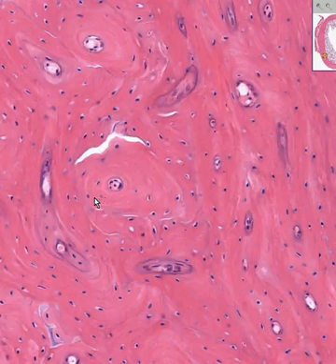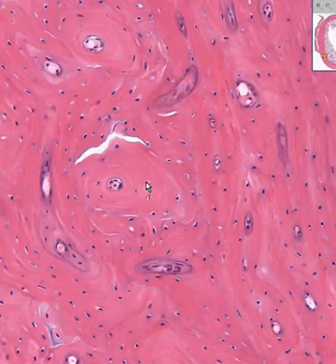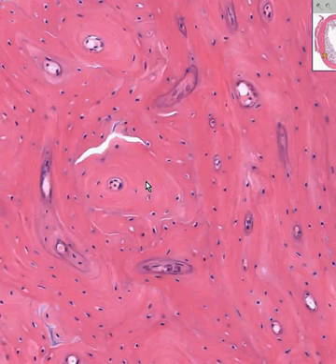And connecting between adjacent osteocytes, which we will see on another stain, will be smaller, tinier canals, which you can't see normally on this type of microscopy. You have to do a special kind of a stain for it. Will be the canaliculi, which are the smallest, tiniest filamentous connections between adjacent or nearby osteocytes.